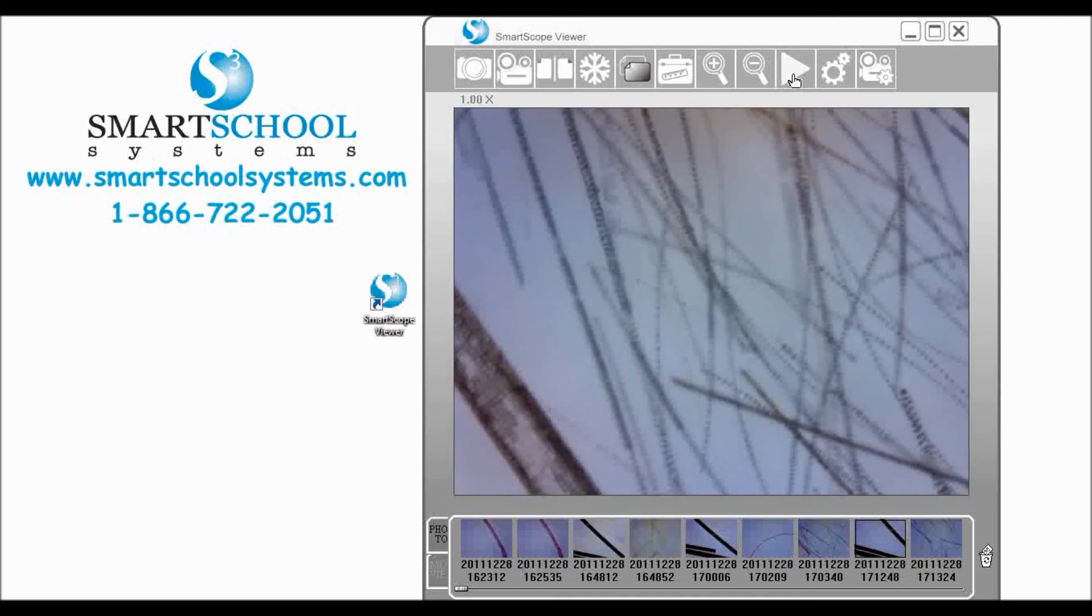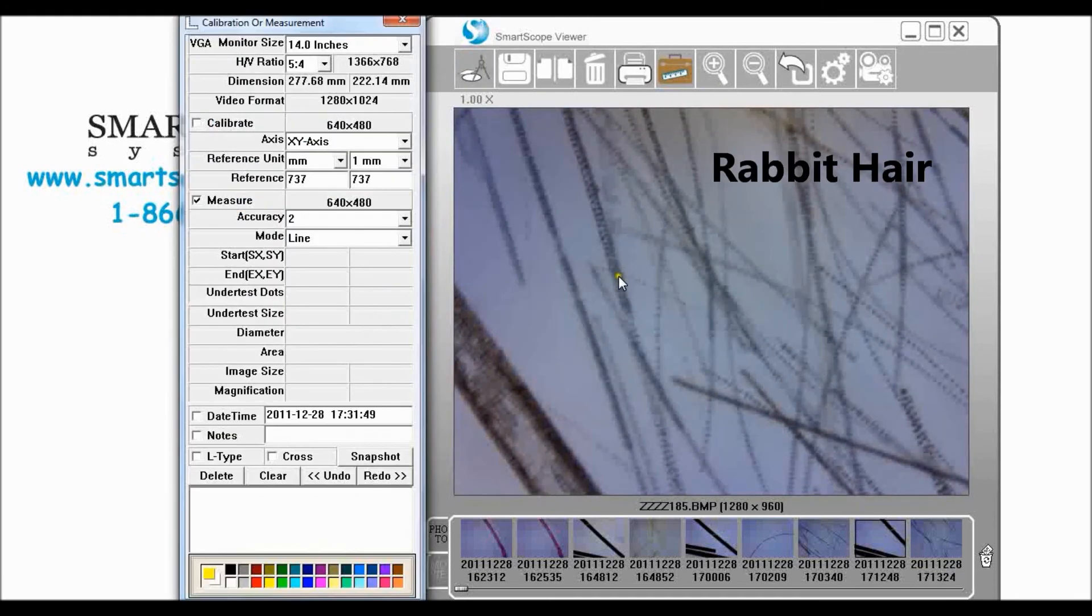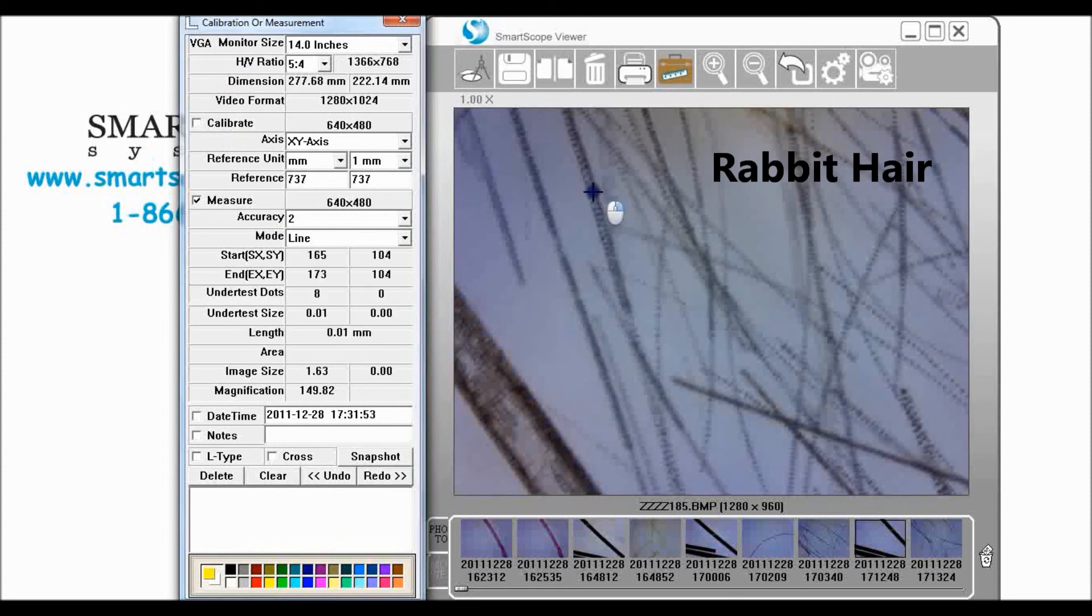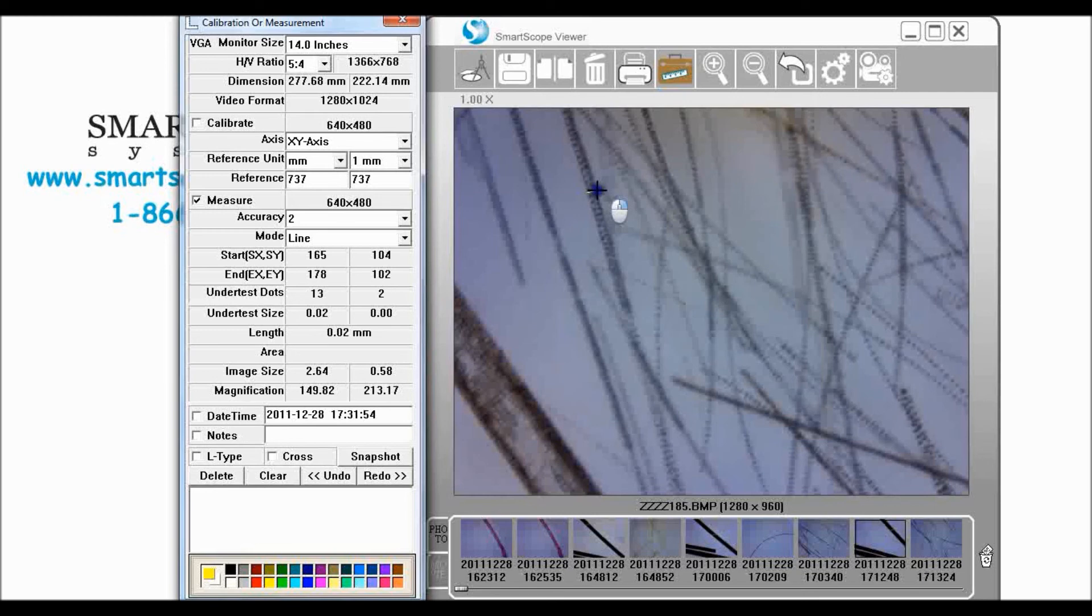And we're going to choose one at random. Click measure and right here I'm just going to take that and go straight across right there and we see that that rabbit hair is two millimeters.